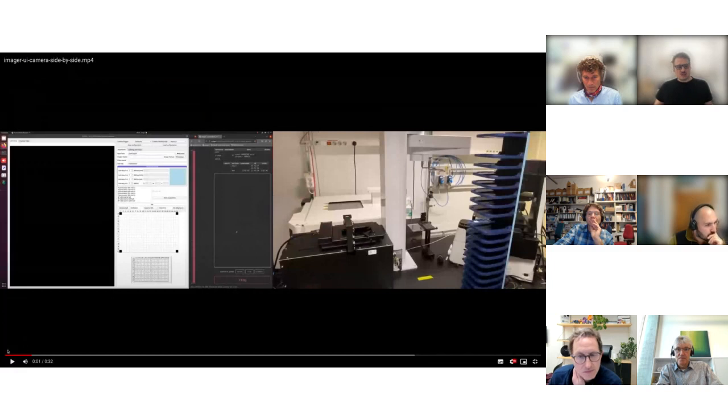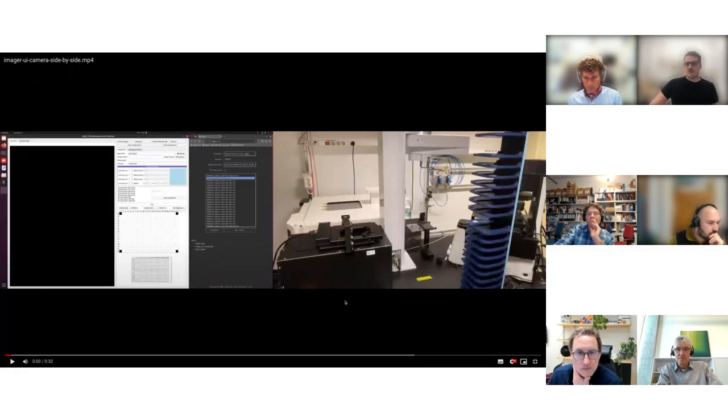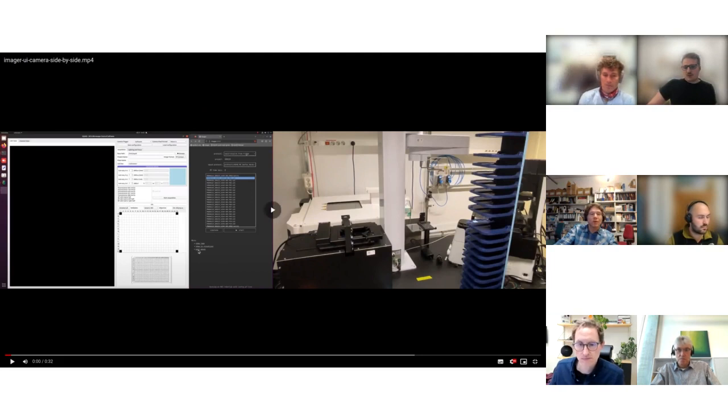And then the second system, where this is finished and we want to image the plates. This system has an automated fridge, a microscope, a Precise Flex robot arm, and a plate hotel. On the video, you can also see a Nikon microscope in the background, which we can also use, but in this video, we use the Squid microscope. And to the left here, you see the interface. There are two different interfaces running simultaneously here, both the robot system, where you queue up plates for imaging, and then to the left, the user interface for the actual microscope.